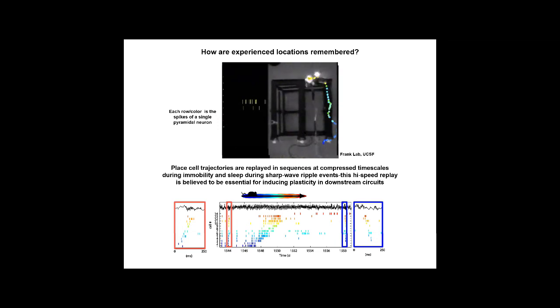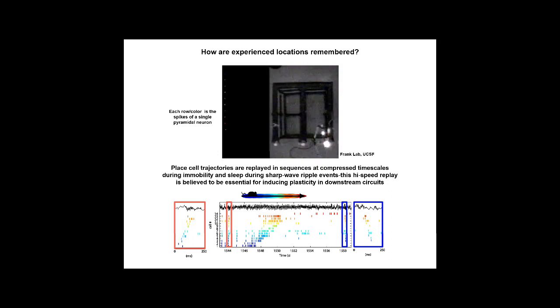And this is the same video, but I want you to watch what happens when it reaches right here at the very end, like 1, 2, 3. This burst of cells is actually the same group of cells that were active along the behavioral trajectory, but now they're happening much closer in time. And it turns out that these trajectories are actually replayed during specific events.